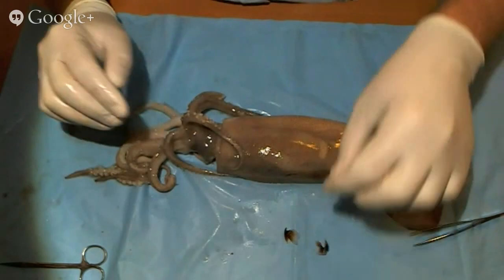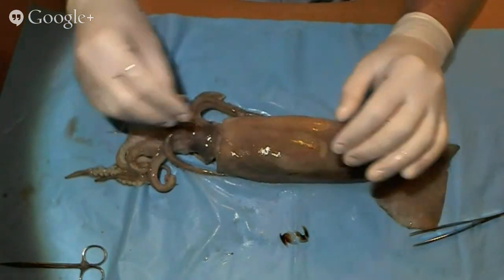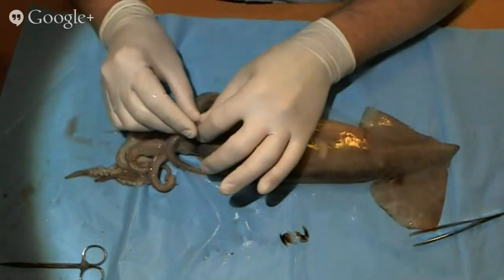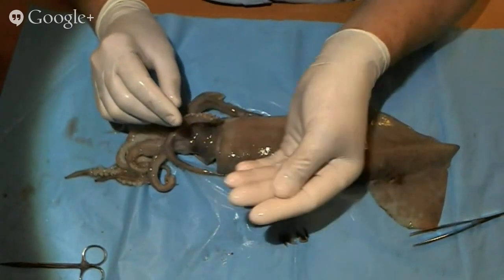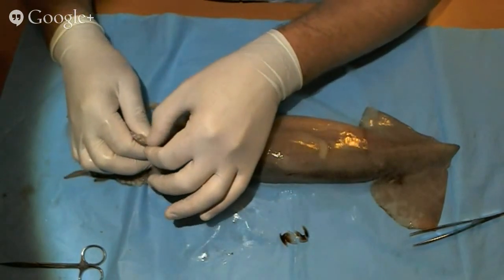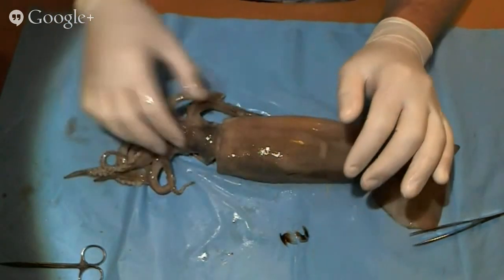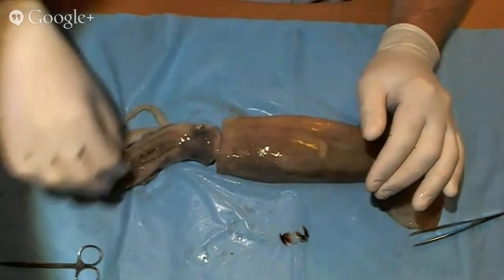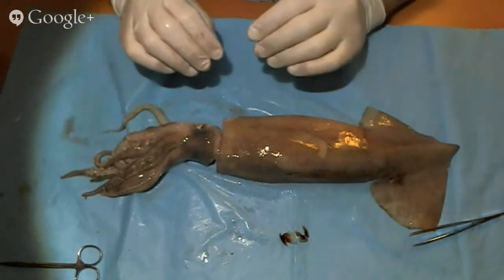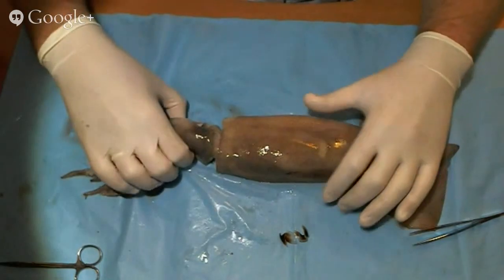Kids can see up close and they can compare this to something else that we're going to find inside the squid. And also you can compare that to those suction cup things that I showed you, the little sharp edges that have teeth on their suction cups. And when you look at them under the microscope, try and get kids to recognize similarities in some way between those. Okay, so we've got how it moves, how it eats.